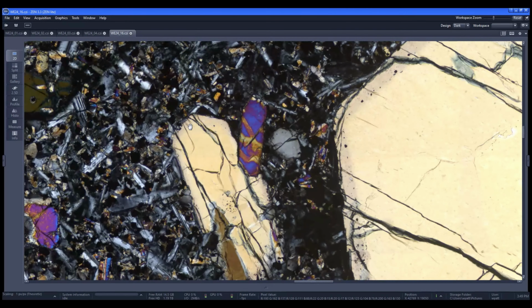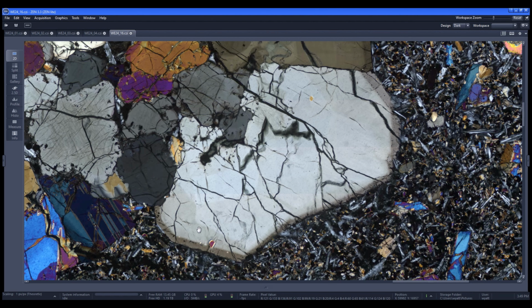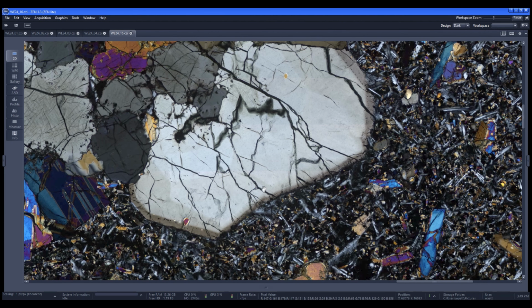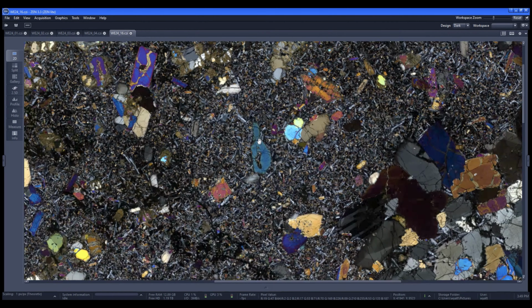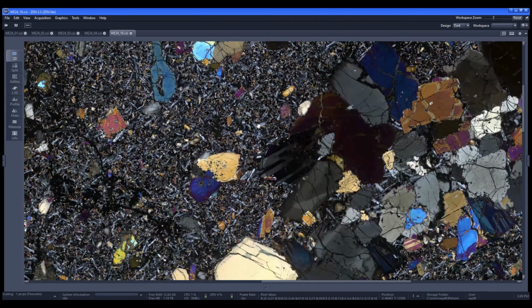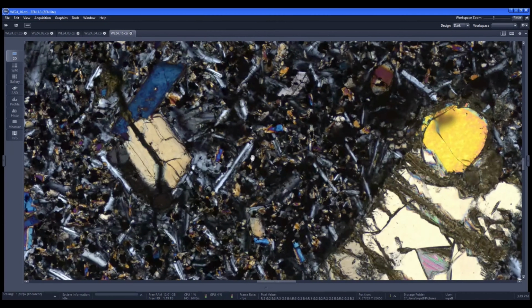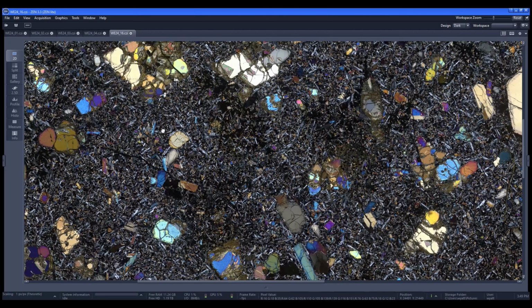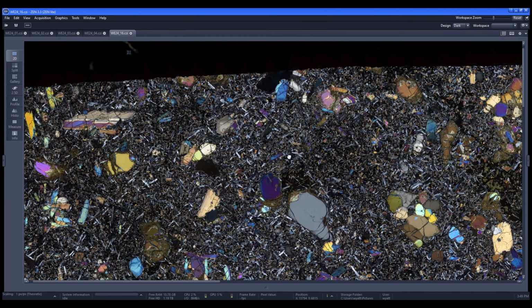You can see there's another one right here. You can see that pink halo a little bit, but it's super noticeable on this one. Here's another titanium augite. The halo's not as pink looking because it's probably starting to go extinct depending on the orientation of this thin section when this scan was taken. And you can see there are a lot of minerals in here. We have olivine here, and of course our pyroxenes, and there's small plagioclase in the matrix. You can see all the plagioclase laths here, but I don't really see any plagioclase phenocrysts anywhere, which is kind of unique because they're pretty common in the other ones.